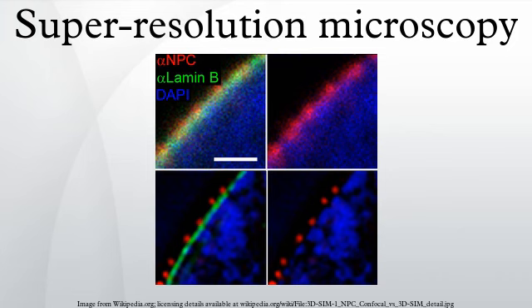the detector is possible. The solid angle that is used for illumination and detection is increased and approaches the ideal case. In this case, the sample is illuminated and detected from all sides simultaneously. Up to now, the best quality in a 4Pi microscope was reached in conjunction with the STED principle.